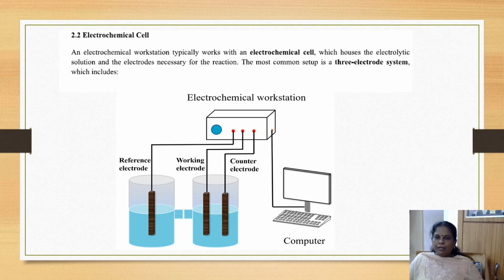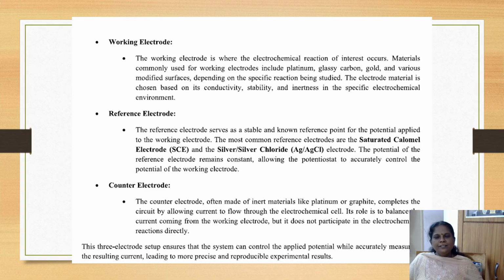On the electrochemical workstation, most of the recent ones are interfaced with the computer where we can get the data, analyze the data and interpret the data, and all these are possible with the modern electrochemical workstation. Let us now see about these three different electrodes in detail.